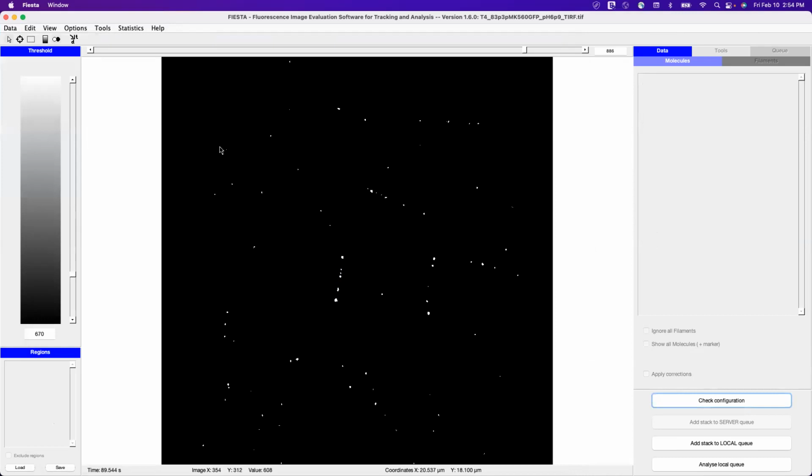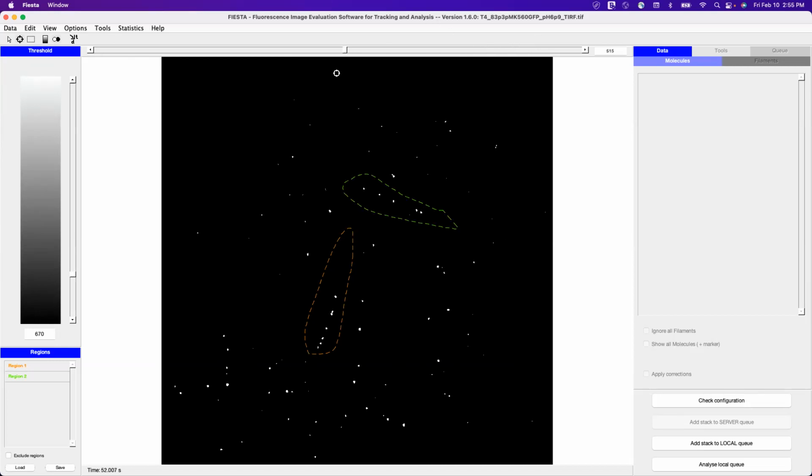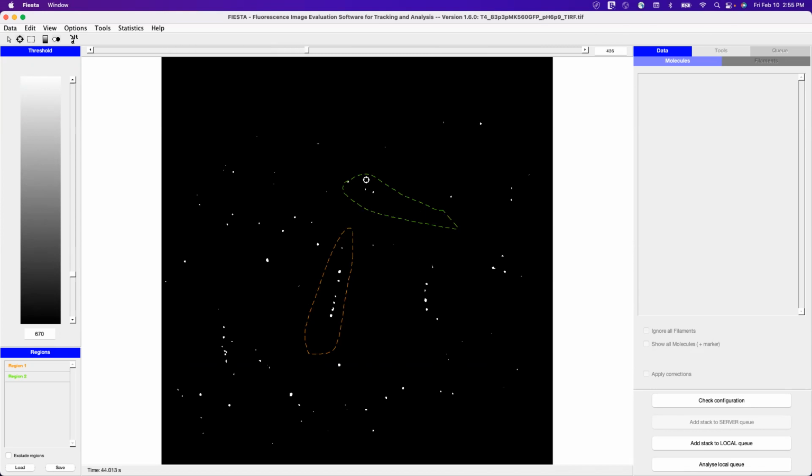Even for reference, let's do this. Clear all traces. We want to do this microtubule, very rough estimates here, just to get a point across, and it depends on your computer's performance. My computer is also slow, so here I have to extend that a little bit.